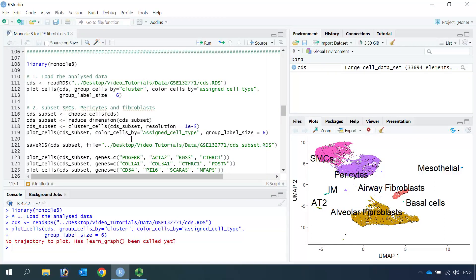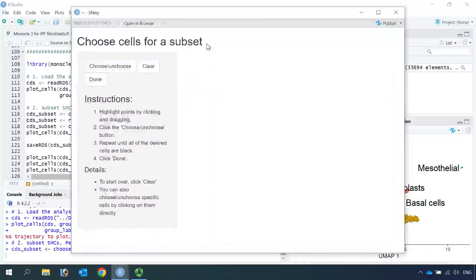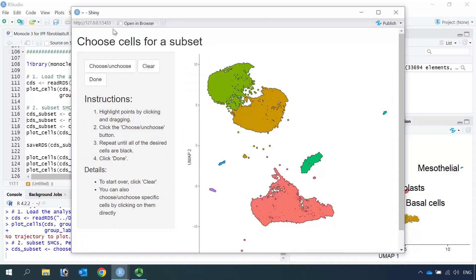We can subset the cells using the choose_cells function in Monocle3. This is similar to the subset function in Seurat, but this one is very easy to use because you can visually choose the cell clusters to subset. So let's run the choose_cells function — it opens another window using the Shiny package, and you can see we have all the cell clusters here.